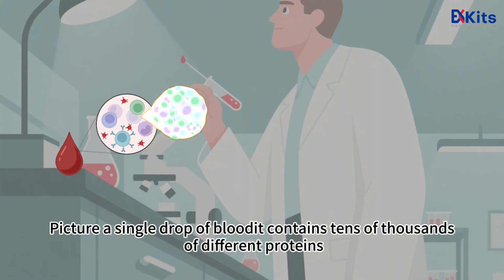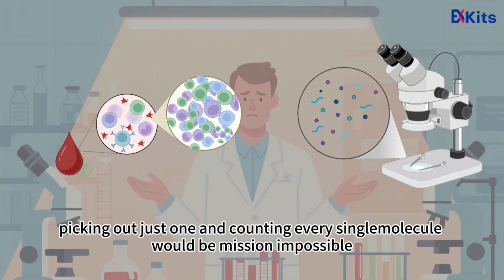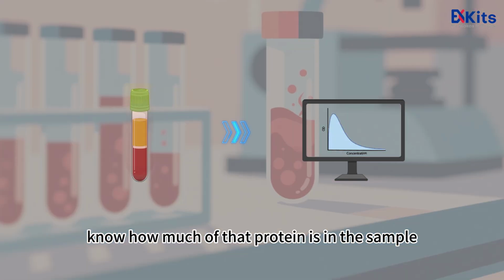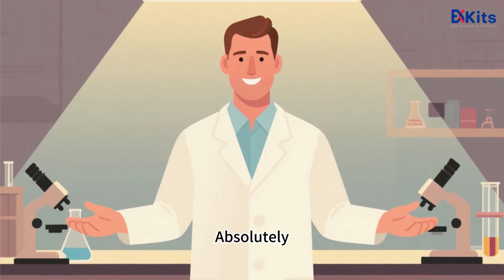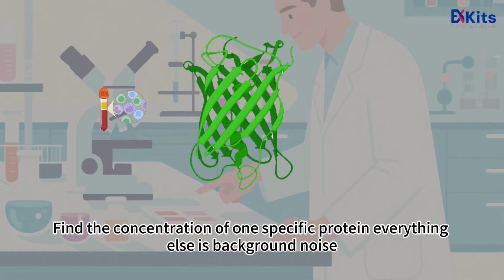Picture a single drop of blood that contains tens of thousands of different proteins. Picking out just one and counting every single molecule would be mission impossible. Is there an easier yet still reliable way to know how much of that protein is in the sample? Absolutely. Our goal is simple: find the concentration of one specific protein. Everything else is background noise.